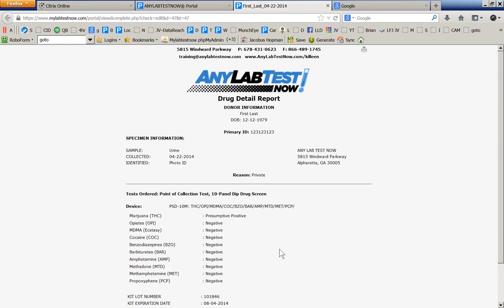So I probably went a little bit fast, but I wanted to show you that creating an instant report is very easy and fast. Any question about this section? Type in a yes if you have a question, type in a no if you don't have a question.